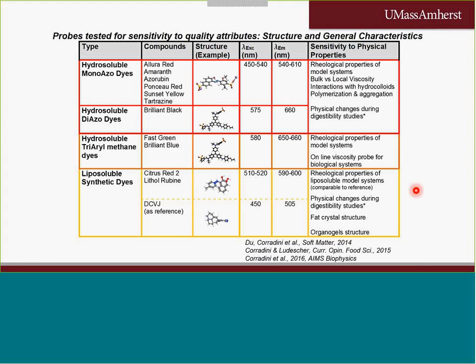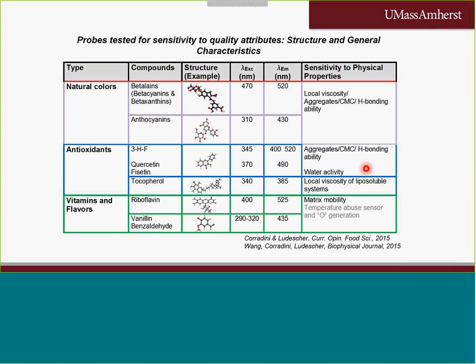And also other characteristics such as water activity and hydrogen bonding ability. These molecules are sensitive to the physical state because most of them exhibit rotor behavior.